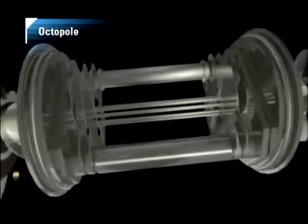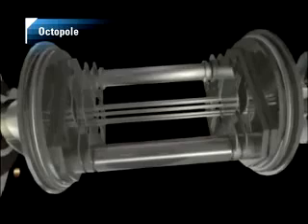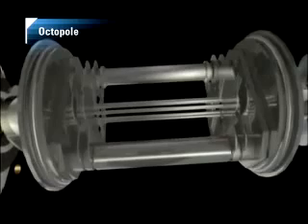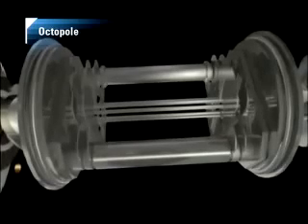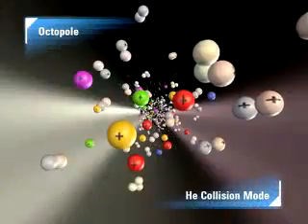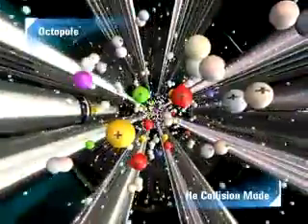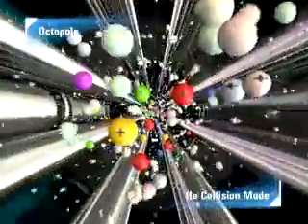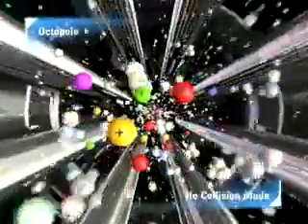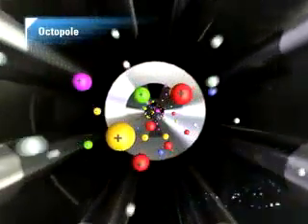Octopoles are small, reducing the size of the cell and allowing operation at higher pressure relative to other systems. This results in more ion-gas collisions and greater interference removal efficiency, which also enables the ORS to operate in collision mode using pure helium collision gas. The larger polyatomic interferences collide more often with the helium atoms than the analyte ions and lose more kinetic energy. A potential barrier at the cell exit allows only the higher energy analyte ions to pass through to the mass analyzer. The low energy polyatomic ions are prevented from leaving the cell by energy discrimination.